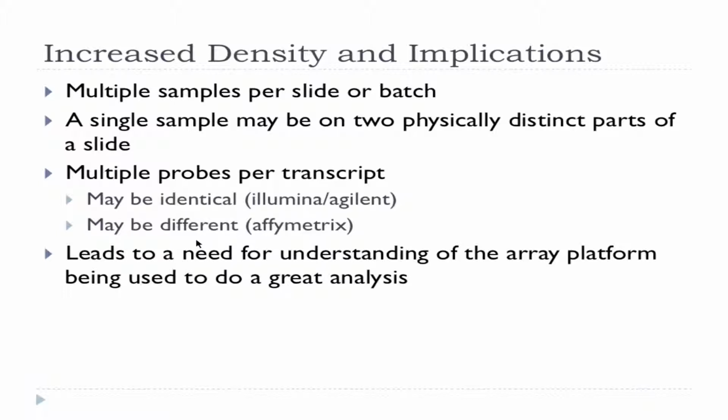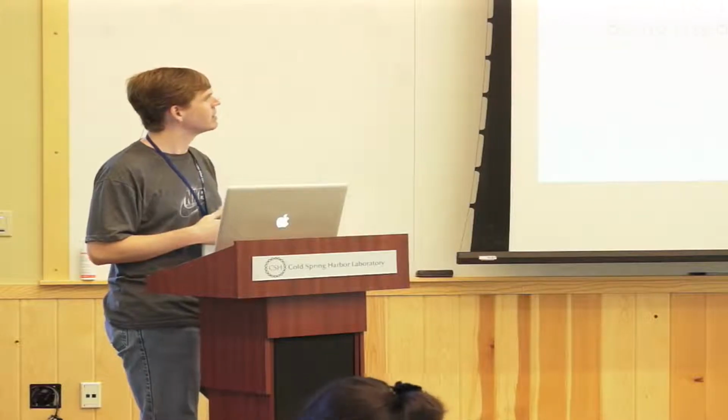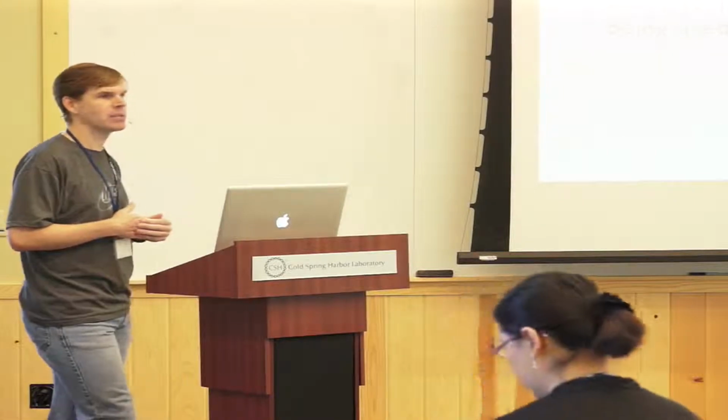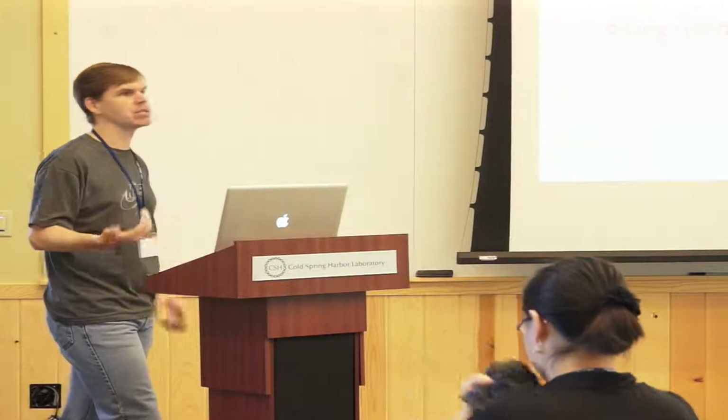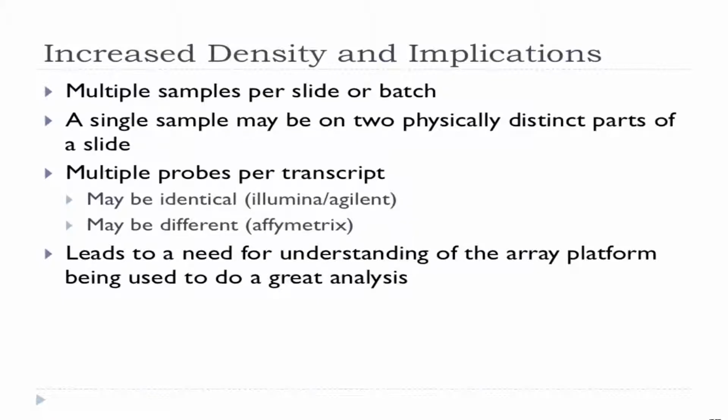And then this leads to a real need to understand the array platform that's being used in order to do a great analysis. You can actually do a lot with someone handing you an Excel spreadsheet and saying, here's my data. But the more that you understand about the array platform being used, the more that you can do to maximize the efficiency or the effectiveness of that array platform.